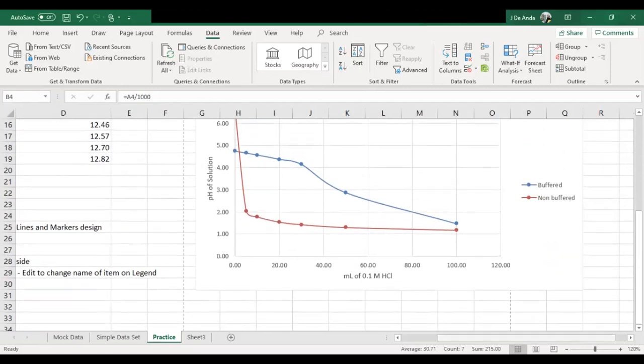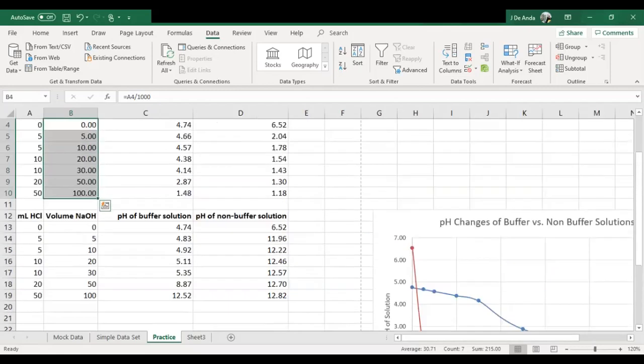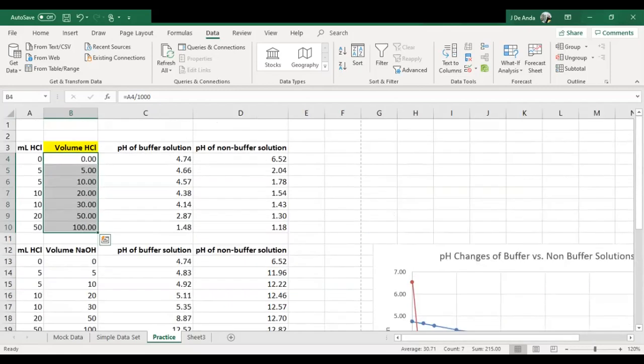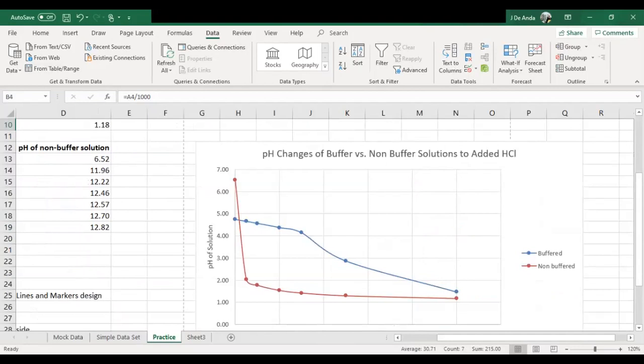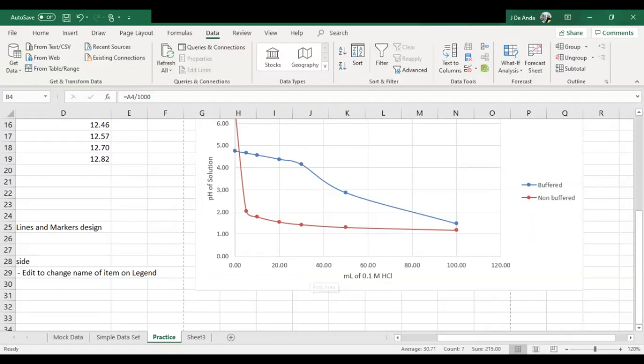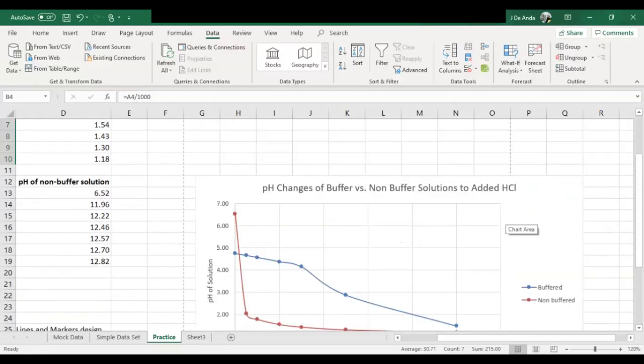In this particular example, I'm not sure that's a huge thing, because like I said, we're not doing a titration. We're not looking for specific molarities. We're just generally qualitatively tracking what the pH change is. The main observation is that one of these starts out rather flat with very little change, and the other rapidly changes in pH. Of course, the one for the base will go in the opposite direction, because it goes from near neutral to high pHs, right?